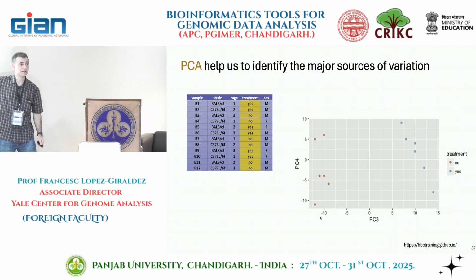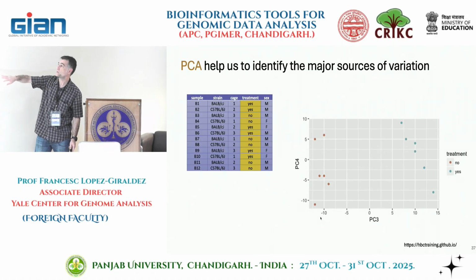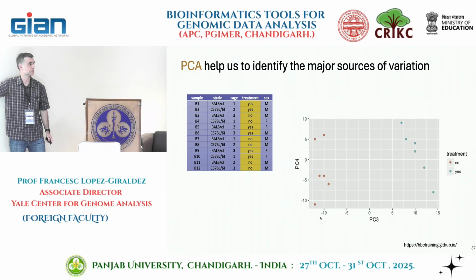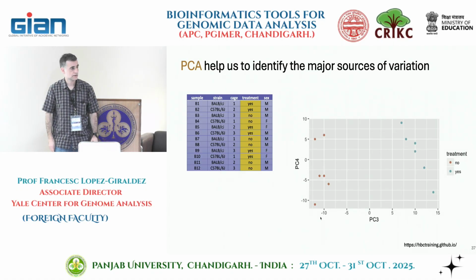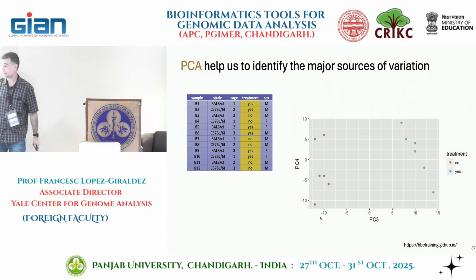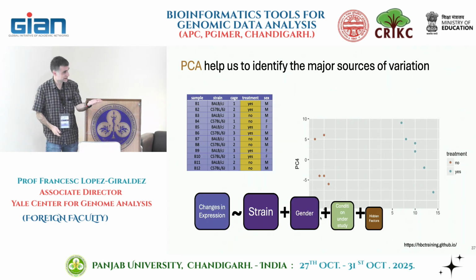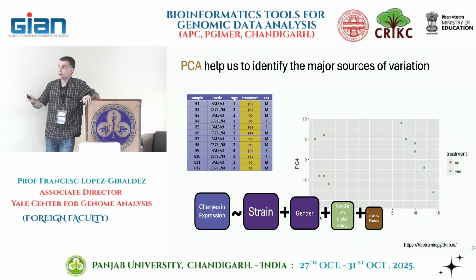But you can plot more PCs. You don't have to stop with PC1 and PC2. If we plot PC3 and PC4, and then we do the treatment, all of a sudden PC3 is separating the 2 colors. Whether this will have the same variability, the same percentage of data? Well, that's a good question, right? I didn't plot it, so we don't know yet. But one thing we can know for sure is this, right?